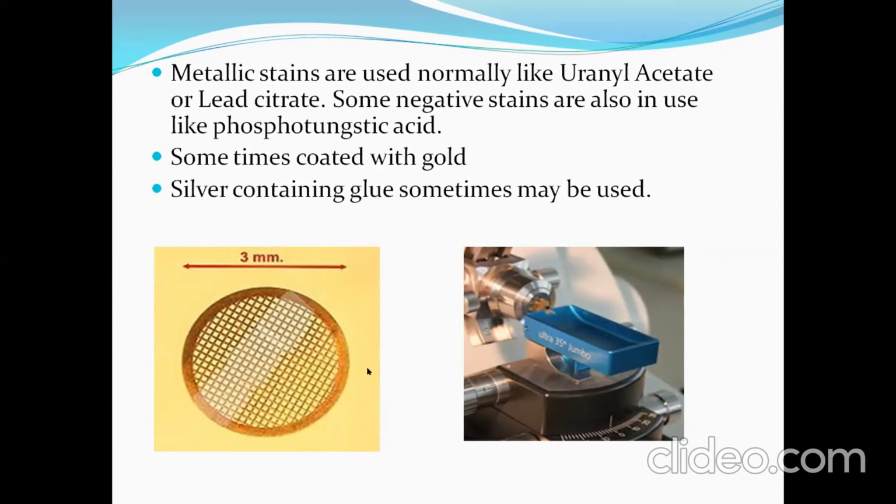And here you can see this is the copper grid, which is normally 3 millimeter in diameter, and the mesh frequency may be variable according to our need. So larger meshes or very closely spaced meshes may be used in this copper grid.